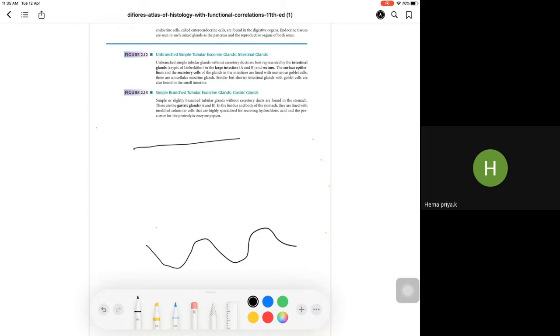Let us see what the types of cells in the skin are. There is one layer here. These are more like round cells or cuboidal cells, and they can show some mitosis. I will put a nucleus in this. Since these cells are dark, I am not showing the clear nuclei. So this is the basal layer, sitting on the basement membrane. So this is the stratum basale.